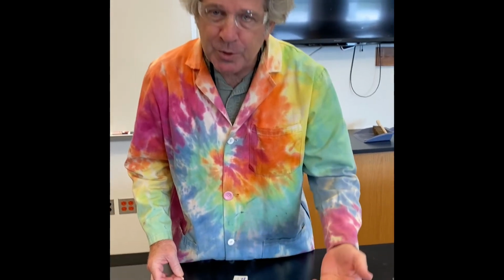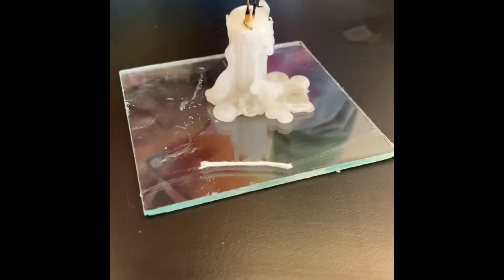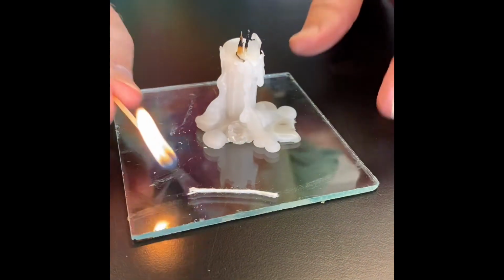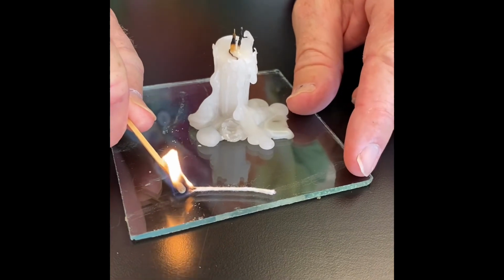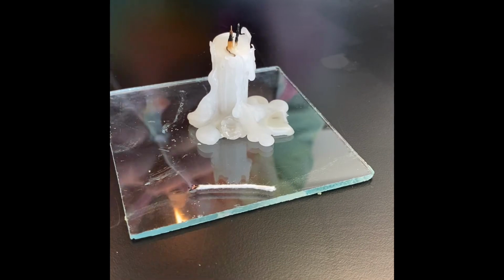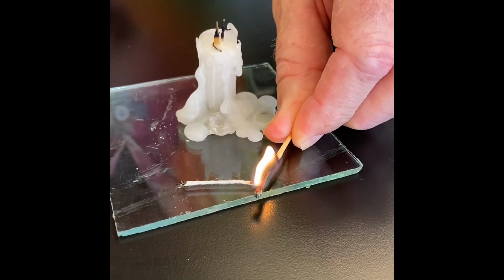So could I just burn a piece of string? Would that work as a candle? String by itself. Well, let's try it and see. I lit the string, but you could see it kind of wants to go out. I'll try lighting it again.